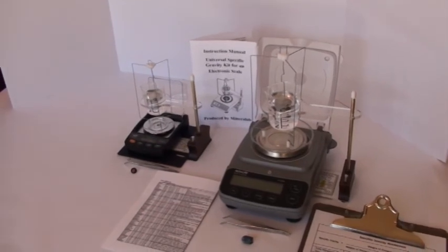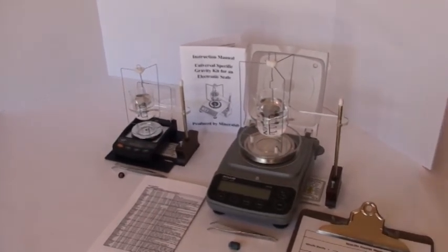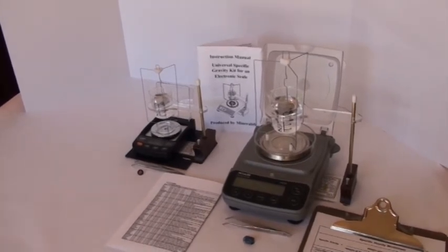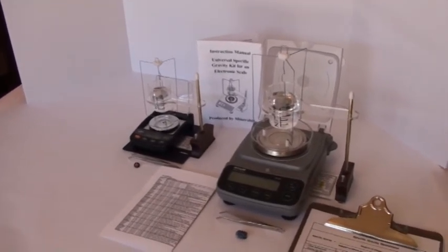Hello, this is Tim Flanagan with Mineral Lab. We are the designer and manufacturer of the universal specific gravity kit for an electronic scale as featured before you here.